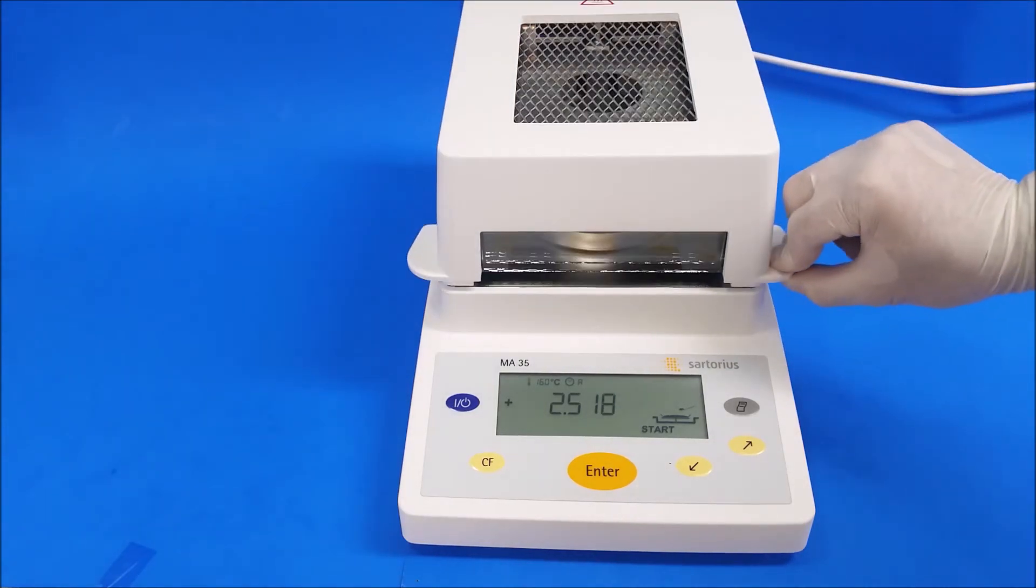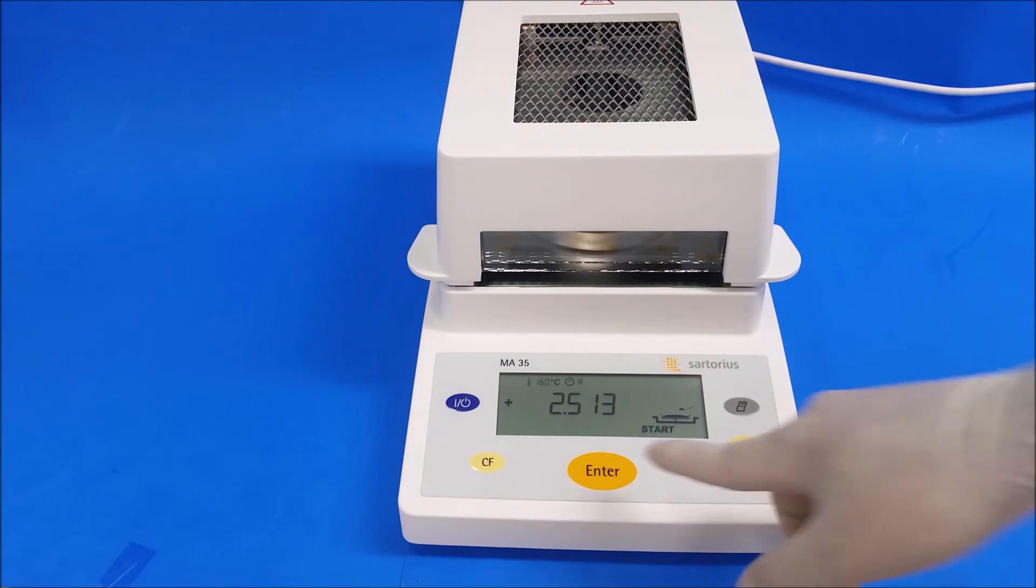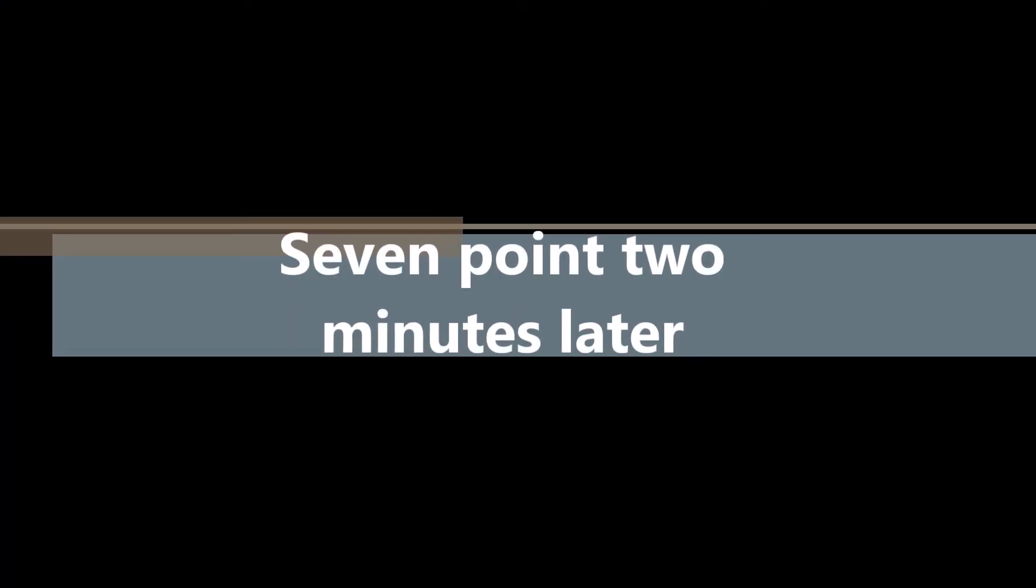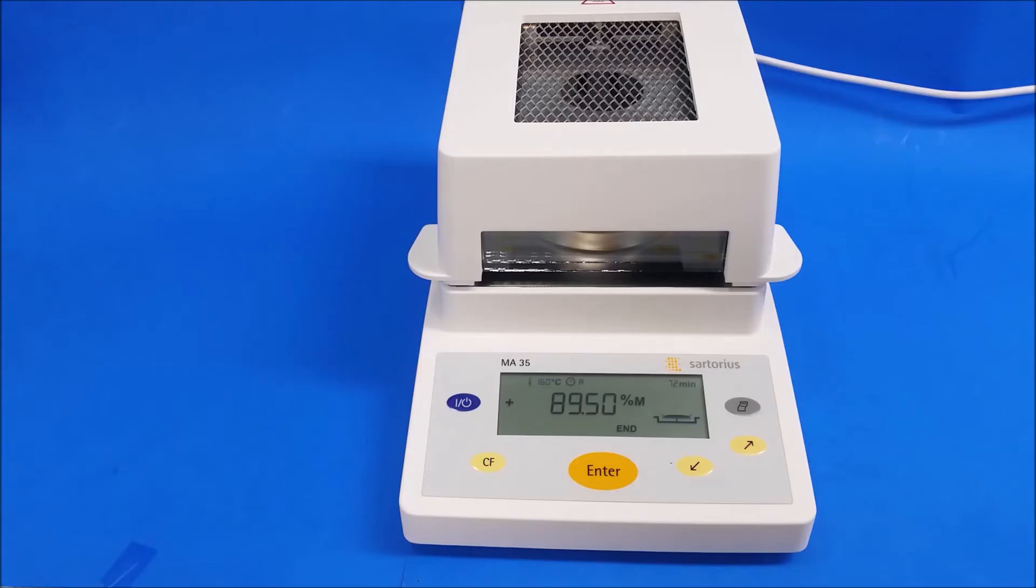Close the hood and press enter to start. Now that it's finished, it's going to give you your results.